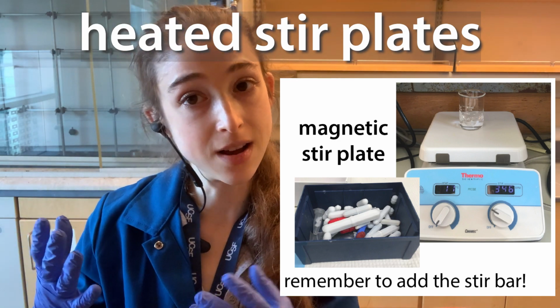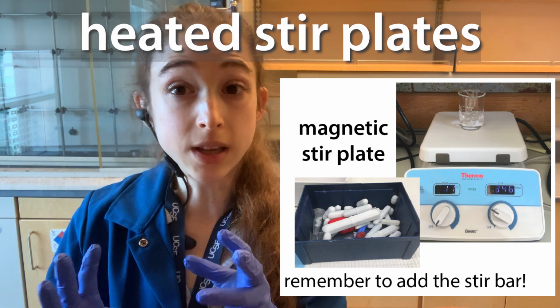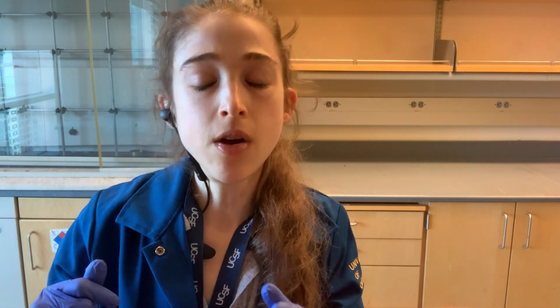So if you're planning on using a hot plate, make sure it really is a hot plate. Okay, there's a few other things that will get things hot, not really for incubating, but they will get things hot. One of these, a Bunsen burner.